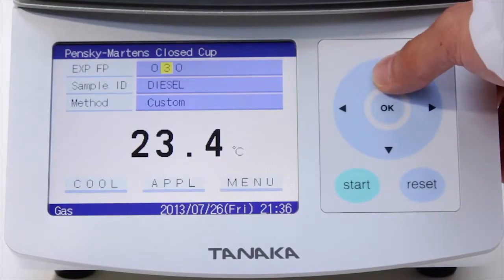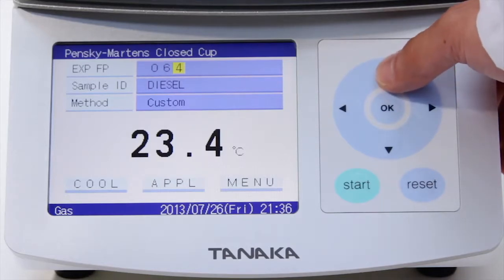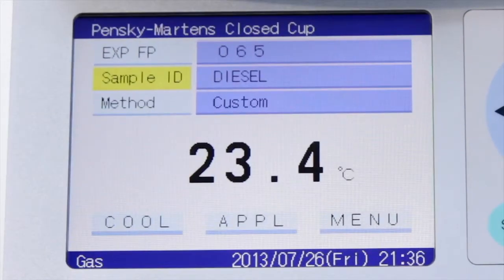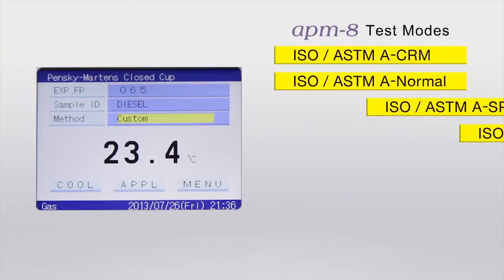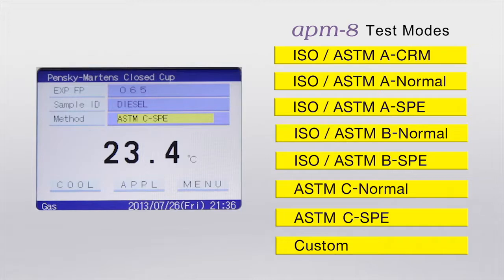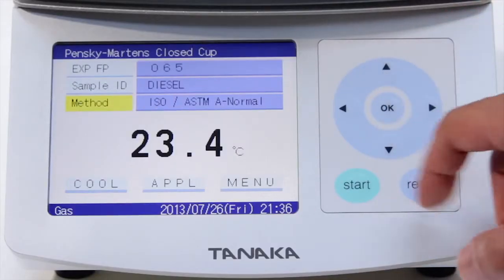There are only 3 steps to perform before starting a test. Enter the expected flashpoint. Enter a sample ID. Then select one of the 8 test modes. The CRM mode, for example, is suited for reference materials, normal modes for ordinary samples and SPE modes for unknown samples. Finally, press the start button.